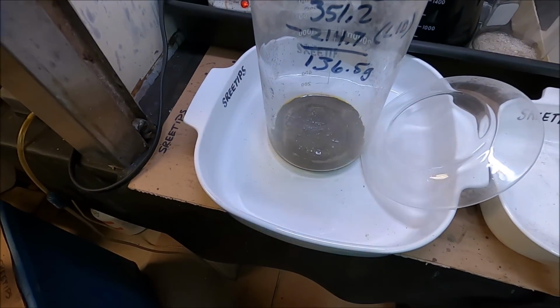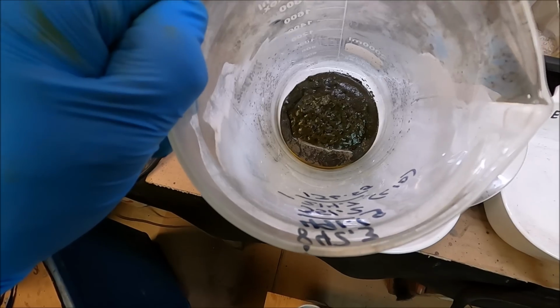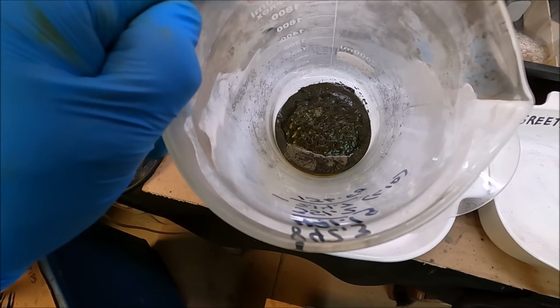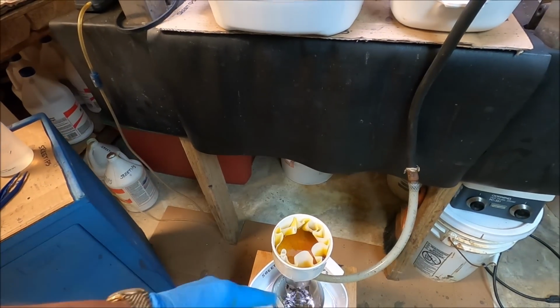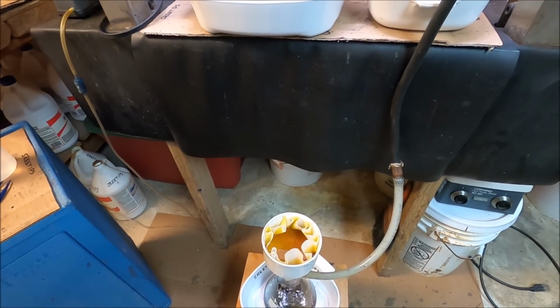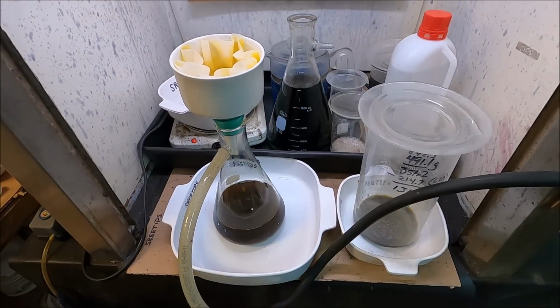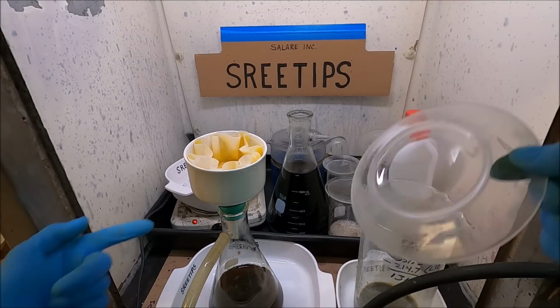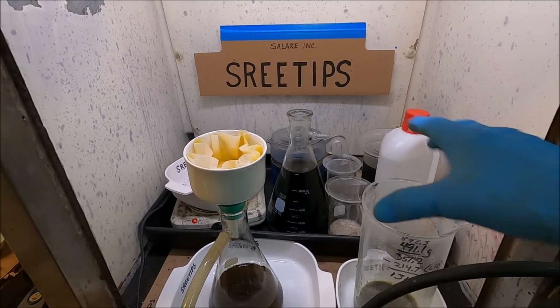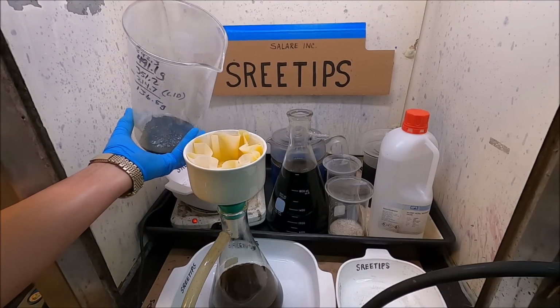I've got these solids left over down here in this beaker. Not sure what's going to be in there, but what I'm going to try to do now is put the solids into this funnel. Now that everything's pulled through the filter there, I'm going to rinse the solids into this filter.